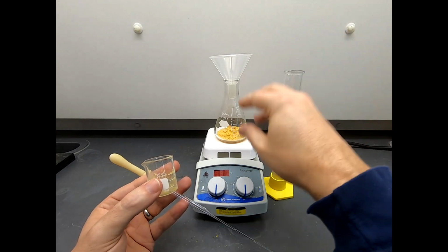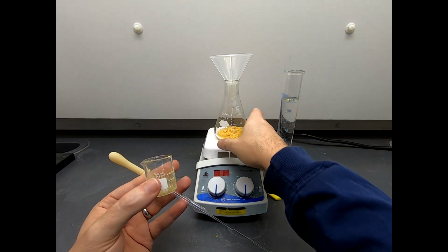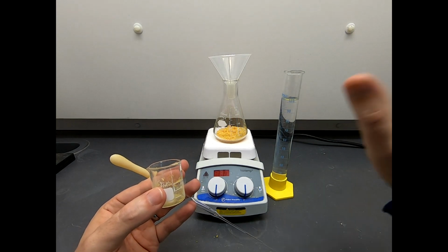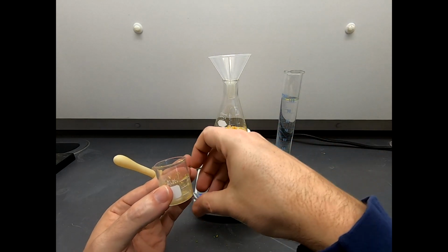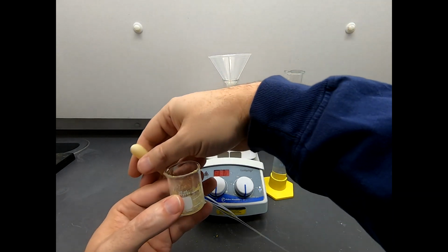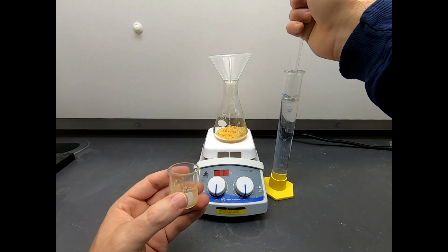and then we're just going to let this stir. And we're going to let it stir pretty hard. There are some chunks in here, and I'd like to break those up as much as possible. It won't be perfect, but let's get it broken up as much as possible, because then the suspended solid we're going to go ahead and filter. So that was a long lead in.